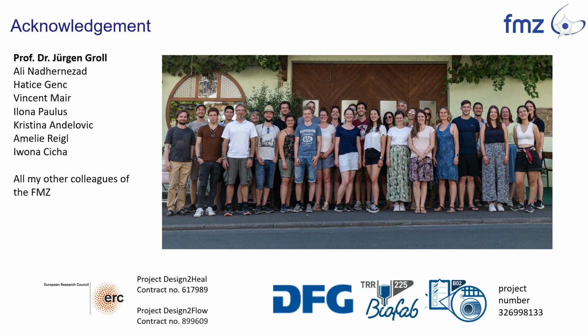Okay, the printing itself is made with the polymer in its dry state, so there is no water involved. So it's basically just normal 3D printing. So we do not have any swelling issues there. But after you create the scaffolds and you add them to the hydrogels, you will see that it swells like 25%, I think it was. But this is, in this case, quite good, because with this we can have this fiber fusion and get these nice bifurcation structures. Thank you.